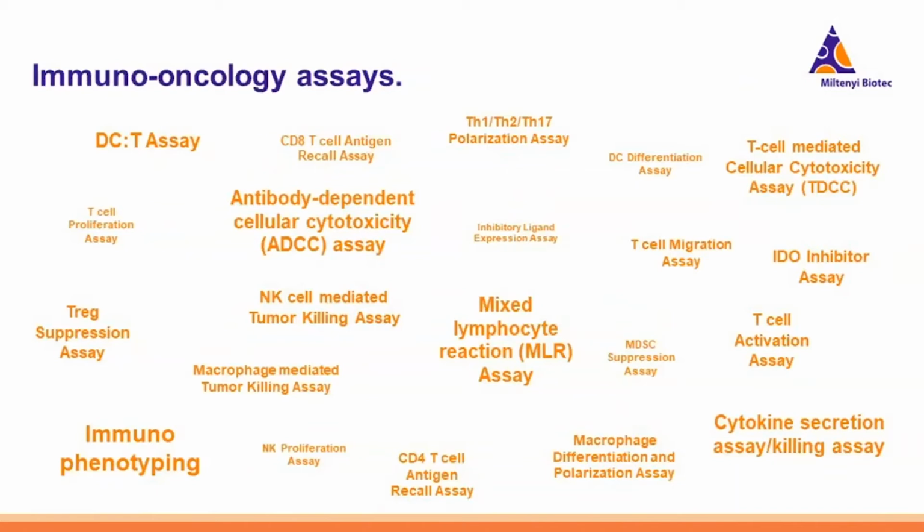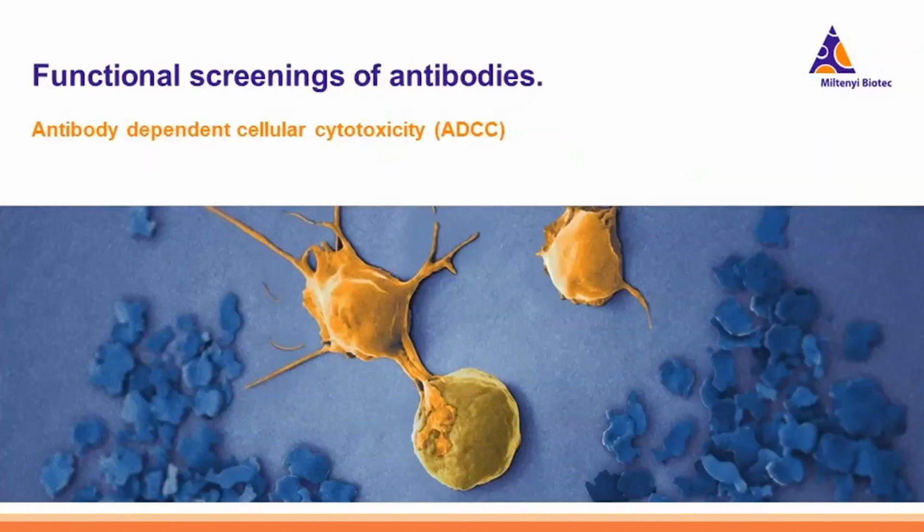It would get really, really late, so I just focused on two of them. As you mentioned before, the ADCC, the antibody-dependent cellular cytotoxicity assay, and the mixed lymphocyte reaction that's also used a lot when people are screening checkpoint inhibitors, and that's why I chose that one. So let's directly hop into the topic of the ADCC.